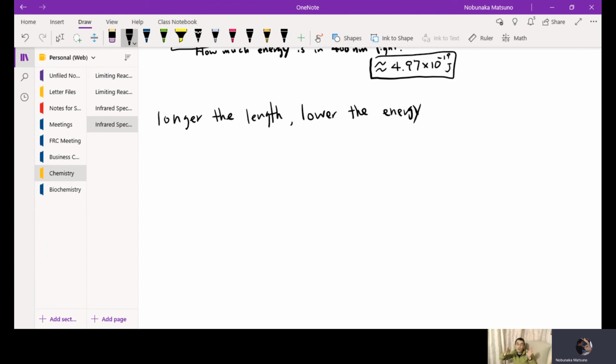Within a 1 second interval, I could move like this within 1 second, right? So which means it's moving like this. The shorter the wavelength, visually speaking, it looks like it has more energy, right? It's sort of intuitive to see it like this: the shorter the wavelength, the higher the energy, but it's not convenient. But the higher the frequency, by the way.